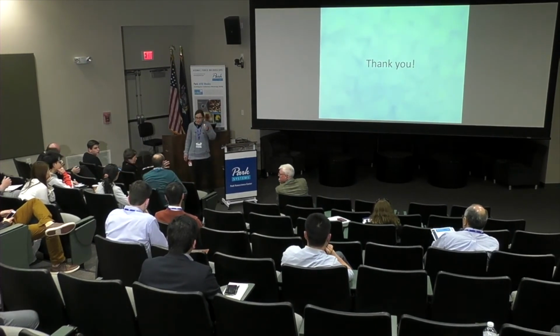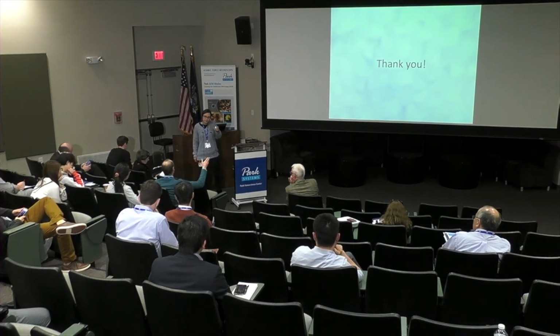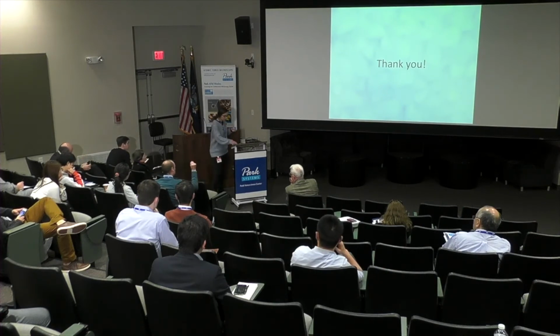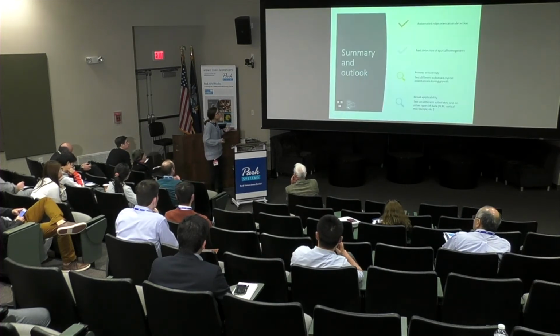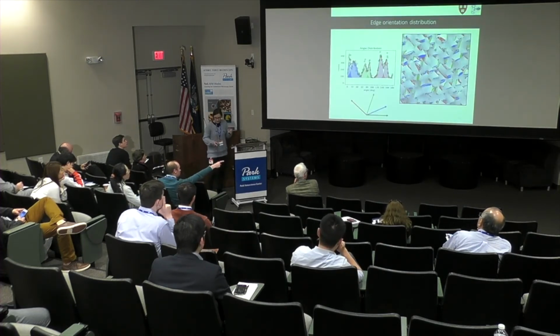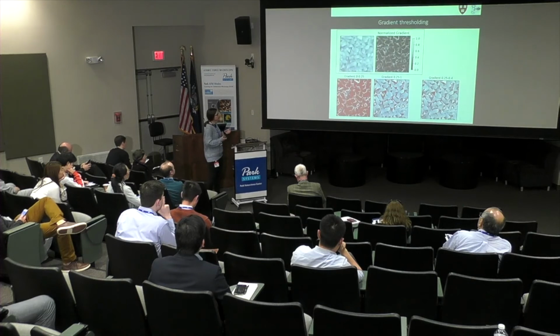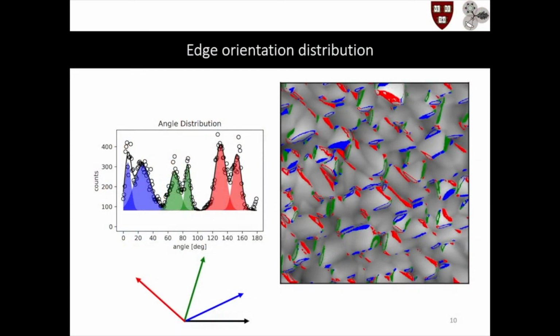Okay. How are you getting the angle out of the image? Because I saw there were a few almost just single spots that seemed to have an angle allocated to them. I could see the longer edges that something might fit through, but there were just specks that didn't seem to have any orientation. So you're talking about this? Yeah, I just see tiny single red points and so on. So in fact, this is the map of the angles filtered through my gradient pick. So that's why there are data points for the angle all over.